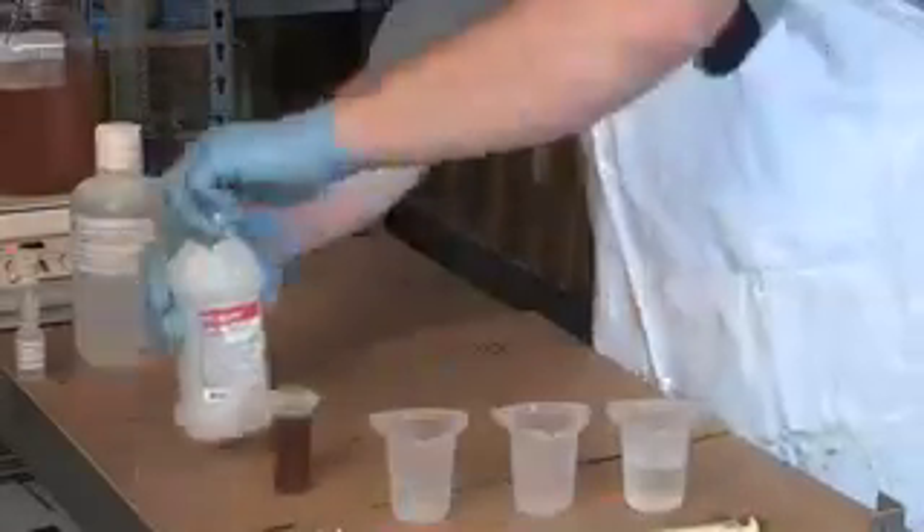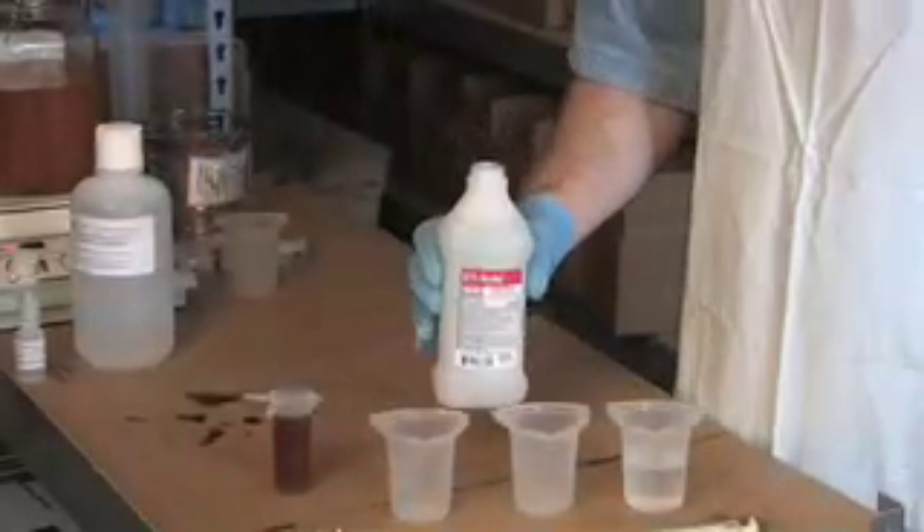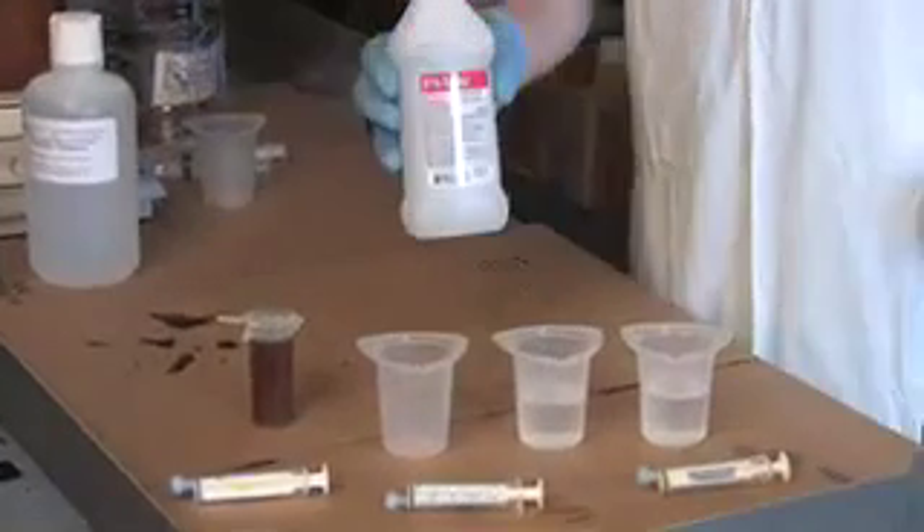I also have isopropyl alcohol — this is 91%. I'm going to put it in a vessel as well so that I don't contaminate it either.